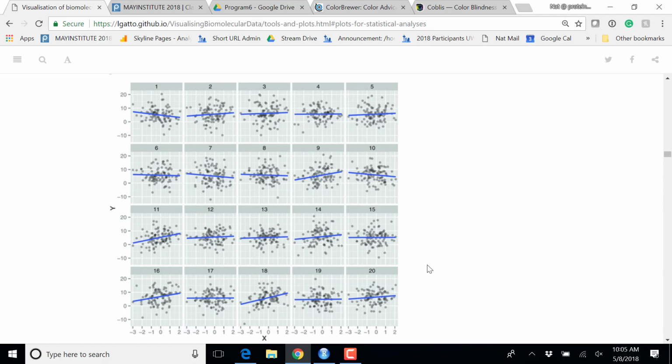in this data. And so what they suggest is, let's do some kind of resampling of the data a certain number of times, and recalculate these correlations, these regressions, and show here these 20 plots. One of them displays the original data, and the 19 others display resampled data from the same data set. Can you spot the original plot? I don't remember which one it is. It is not this one.